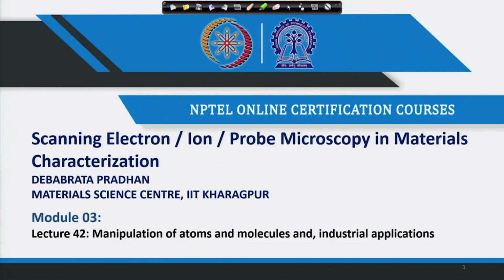Welcome back to the course on scanning electron ion probe microscopy in material characterization. In our last couple of lectures, we have discussed different types of forces used in atomic force microscope to measure different types of properties such as electrical properties, mechanical properties, chemical properties. These properties are measured with a particular type of force in atomic force microscope.